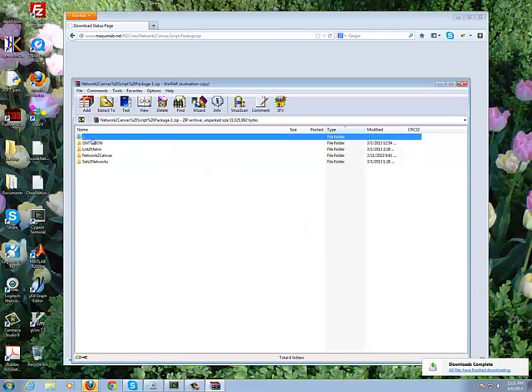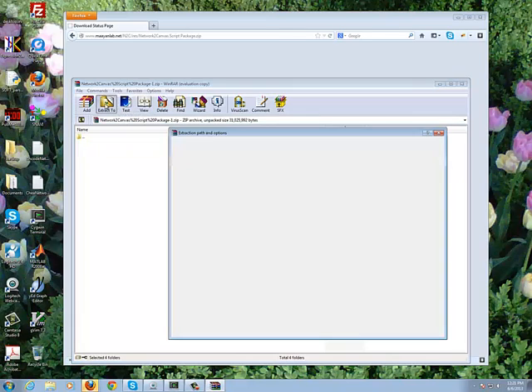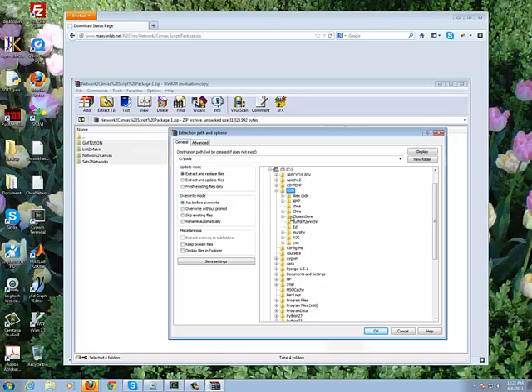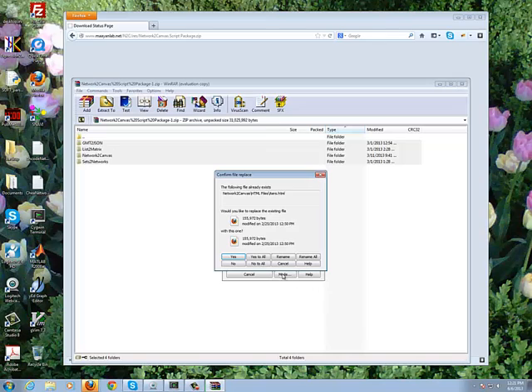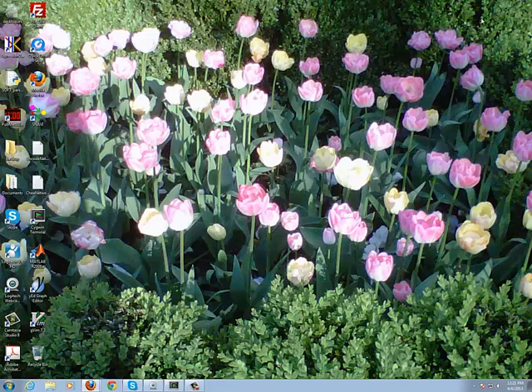And then you can extract the content of that package into a local directory. So I'm going to extract it into a directory I created called code/n2c. And since I already did that a few minutes ago, I'm going to override the content. Once I have those scripts ready in that folder, I can close those two windows.